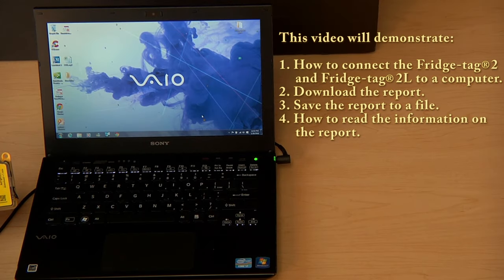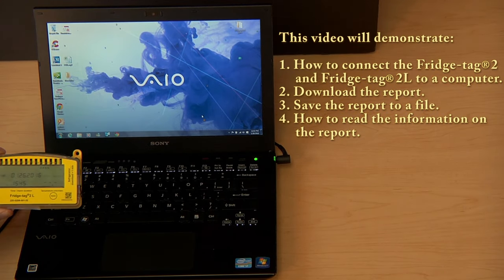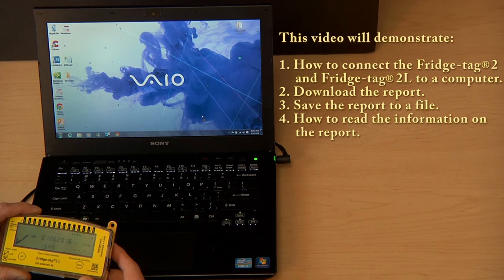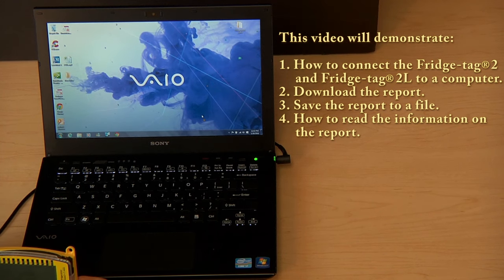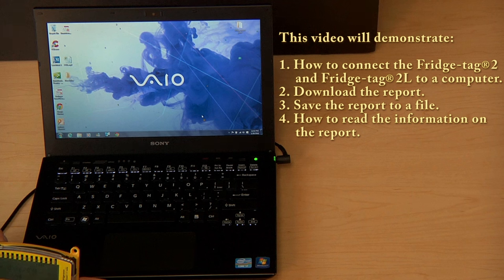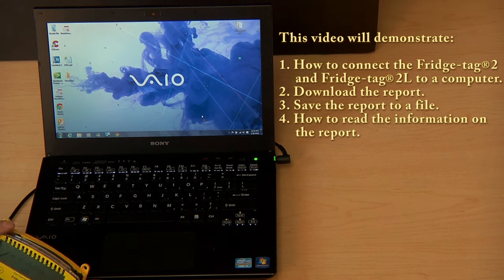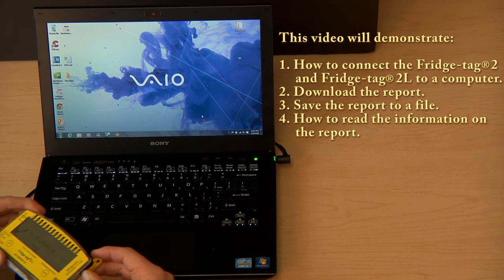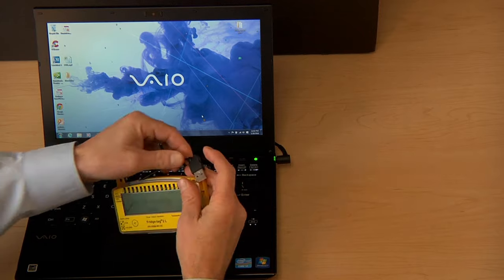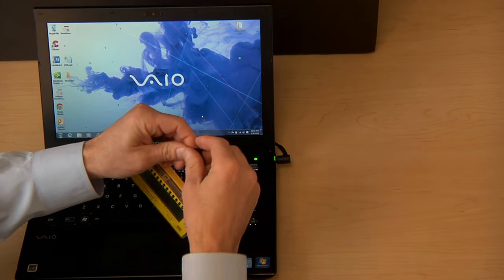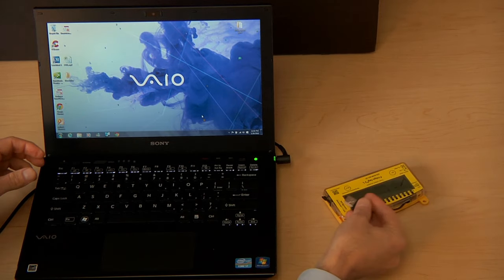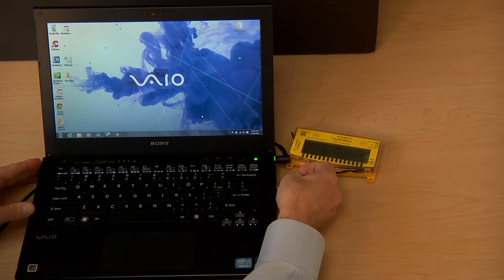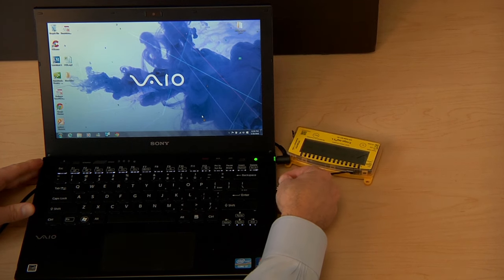In this video we will demonstrate how to connect the Fridgetag 2 and Fridgetag 2L to a Mac or PC, download the report, save the report to a file, and read the information on the report. Every Fridgetag is equipped with a USB cable attached that can be connected into a standard USB port.